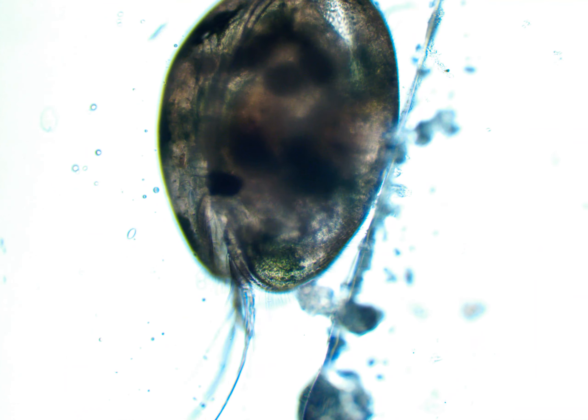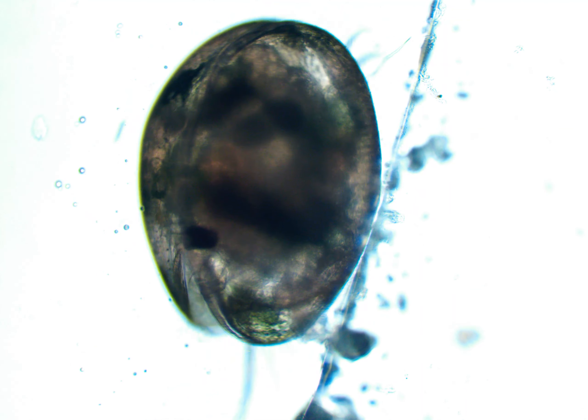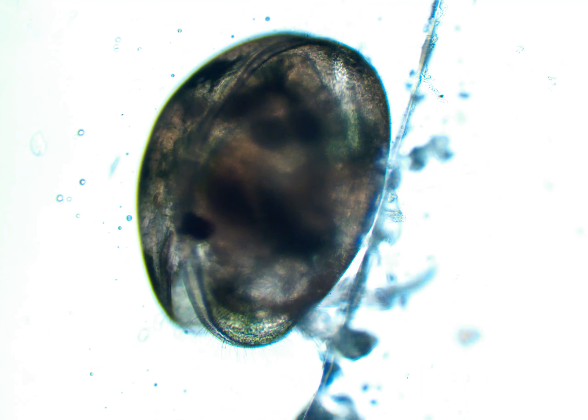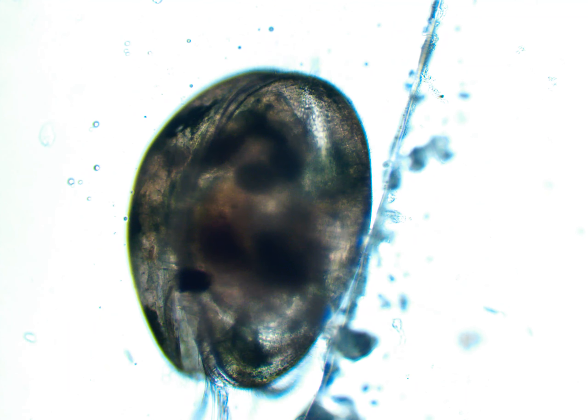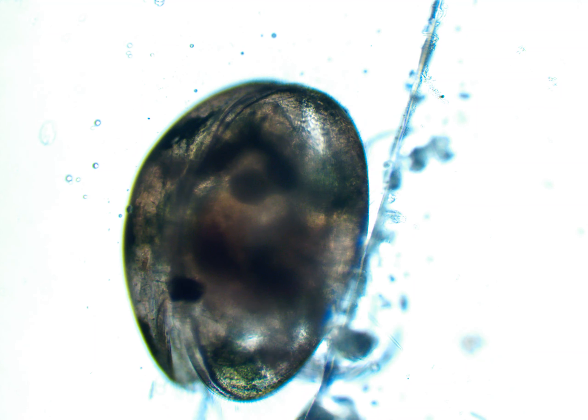This is a freshwater ostracod, but some of them are also marine species. So you can also find these in saltwater plankton.